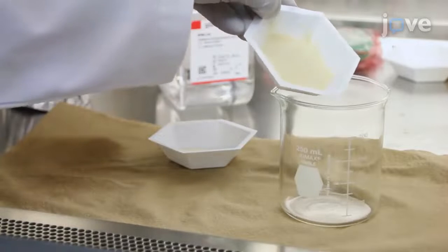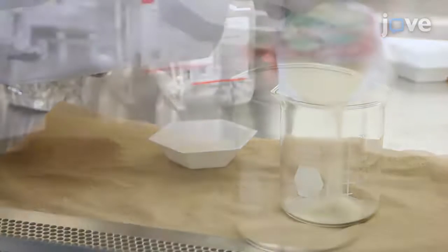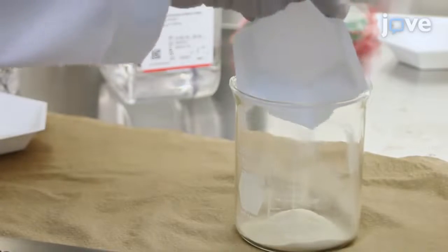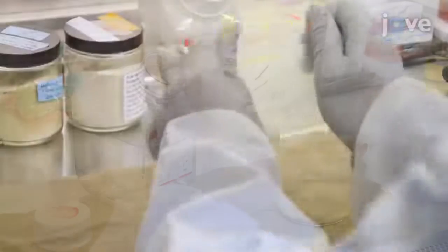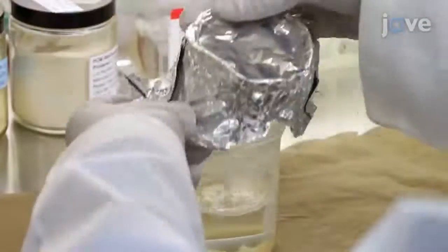In a biosafety cabinet, mix 3g of alginate and 7g of gelatin powder in a 250ml beaker. Add a magnetic stirrer and 100ml of DPBS. Seal the beaker with sterile paraffin film and aluminum foil to avoid contamination.